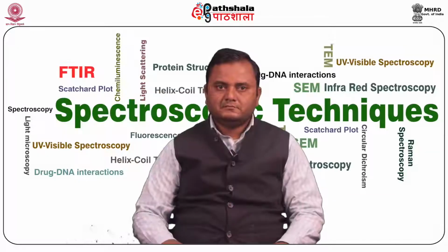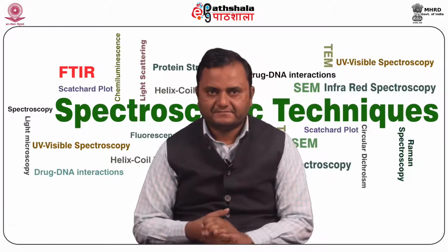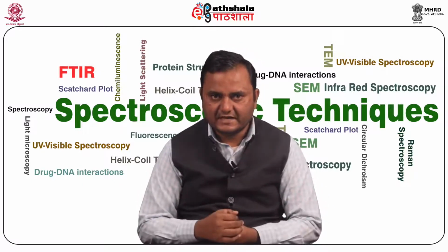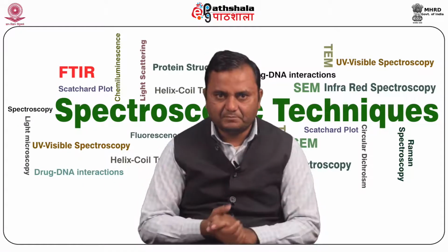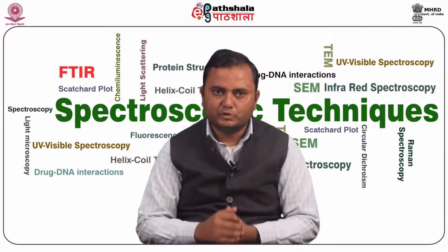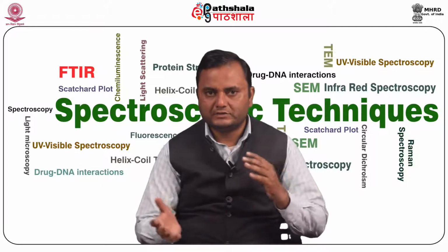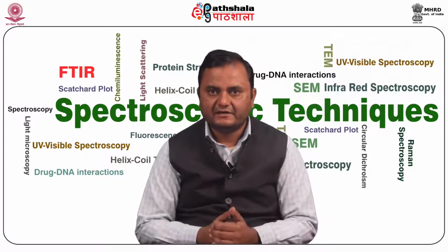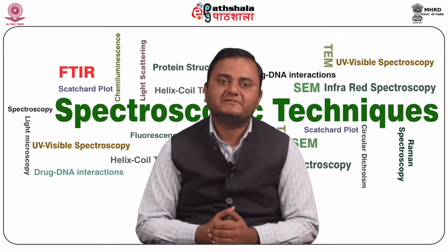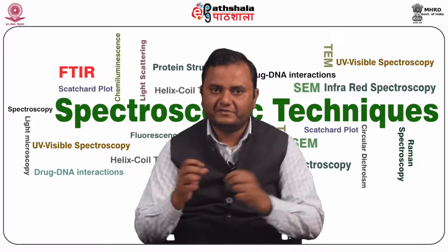But if waves are in opposite orientation, completely out of phase, it leads to destructive interference and the result is zero. Now we talk about the Michelson interferometer, the simplest interferometer design, which has a beam splitter for dividing the incoming IR beam into two parts. Two plane mirrors reflect the two beams back to the beam splitter, where they interfere either constructively or destructively depending on the position of the moving mirror.